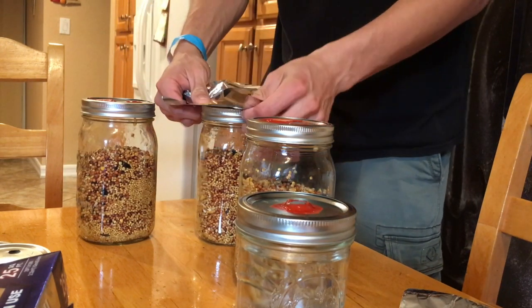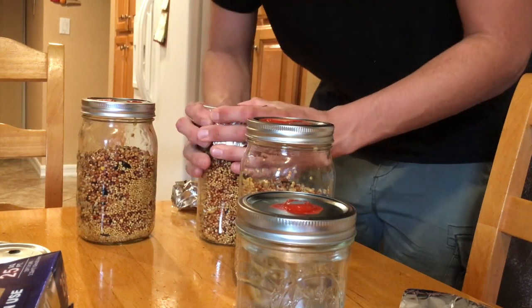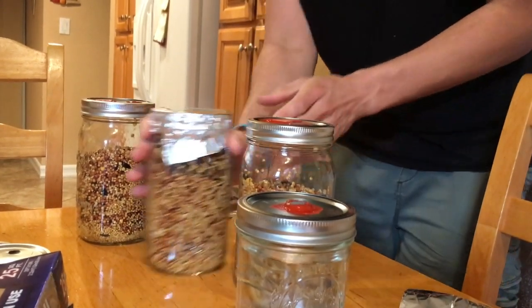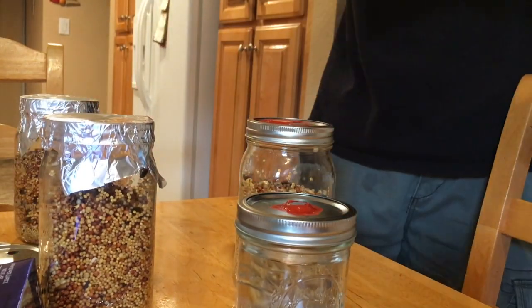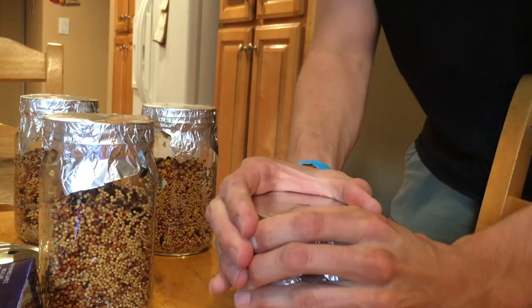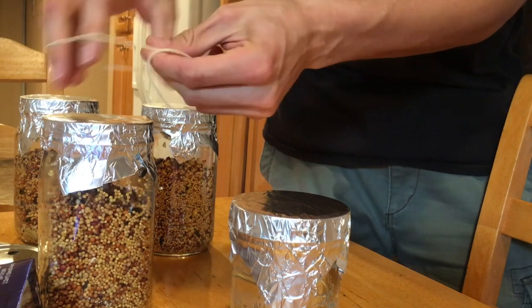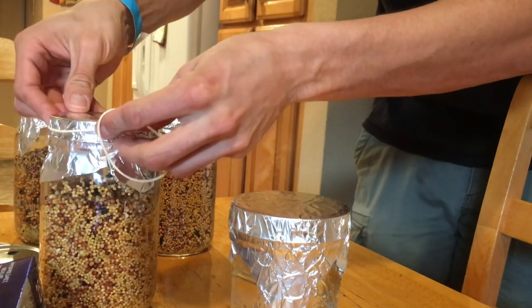Go ahead and cover your jars firmly with foil so no water will get inside. We don't want to change the water content inside the jar, which is the reason for recovering with foil. Now get a rubber band and close them up — this is just to ensure that the foil is not going to pop off during pressure cooking.